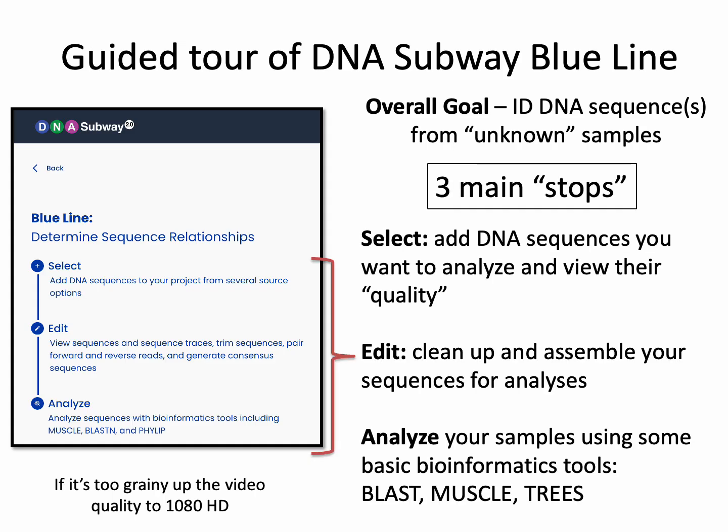Select, where you'll upload and view the sequences you want to analyze. Edit, where you'll clean up and assemble your sequences. And Analyze, where you'll explore your sequences using some basic bioinformatic tools like BLAST, Muscle, and build phylogenetic trees.